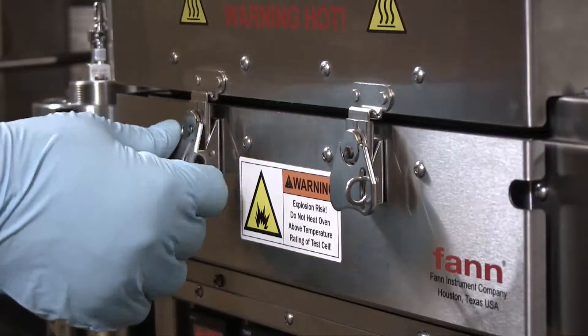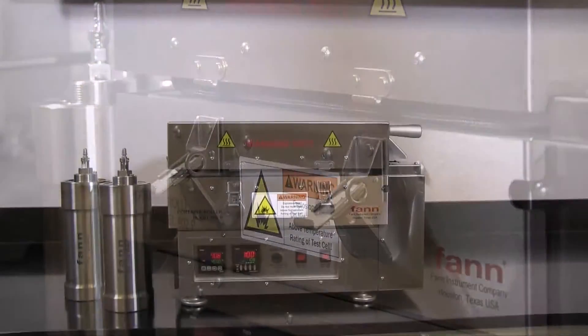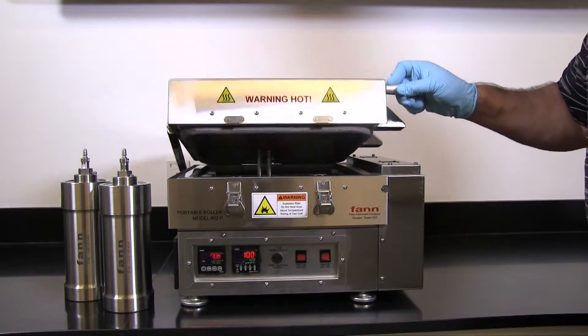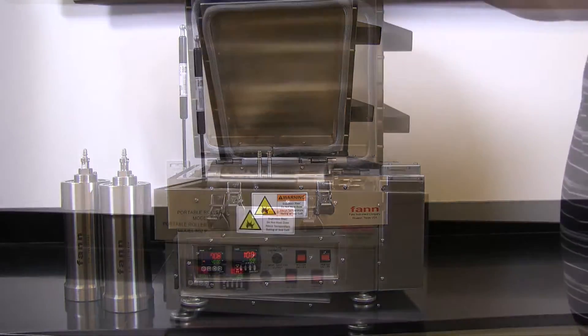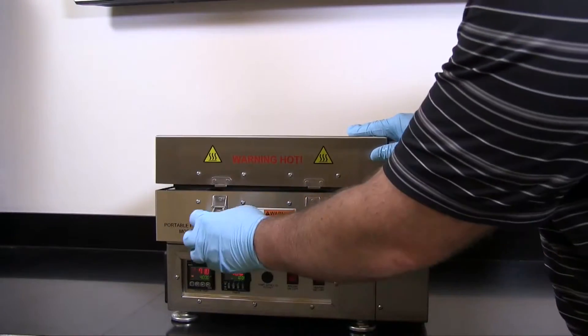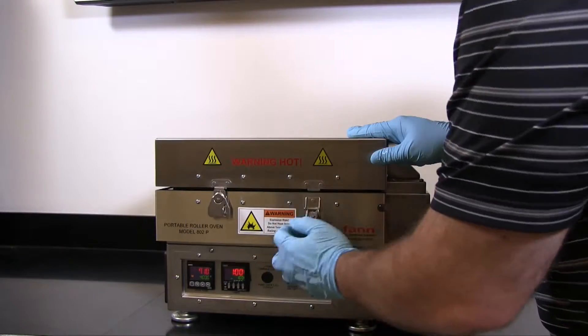Safety is a crucial part of this oven's design. It meets the requirements of the IEC system for conformity testing and certification of electrical equipment. The exterior of the oven remains safe to touch at high oven temperatures, and the lid has safety latches and can be locked down.